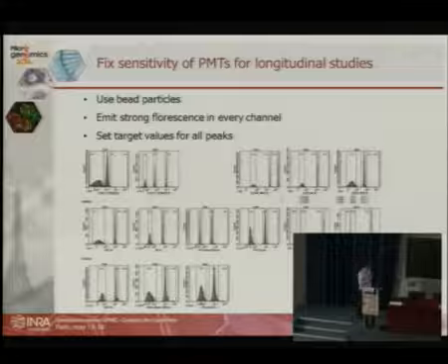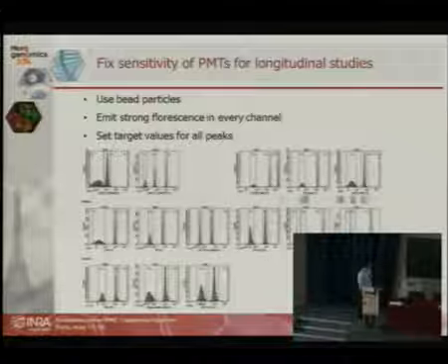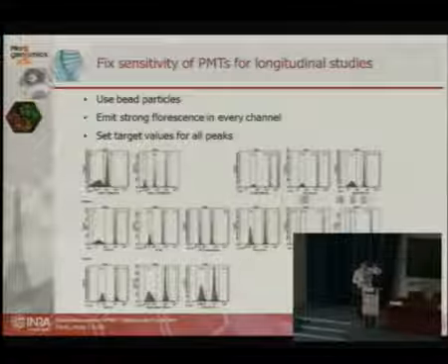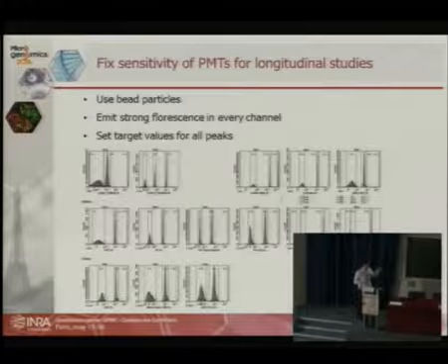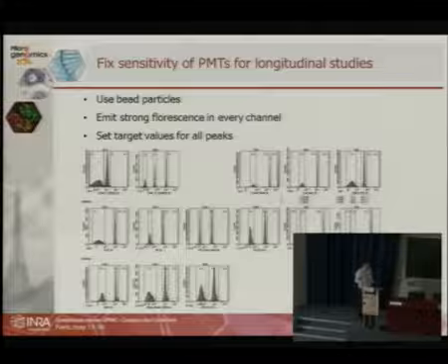So you will monitor the mean channel value of this peak on day 1, and then on day 5 you will pass exactly the same beads, and you will just make sure that your beads fall in the exact same channel, and that may tell you that you need to push PMTs, the voltages and so on. But what matters at the end is where your positive population falls, because beads don't change in their properties, it's physics, they are intrinsically fluorescent.